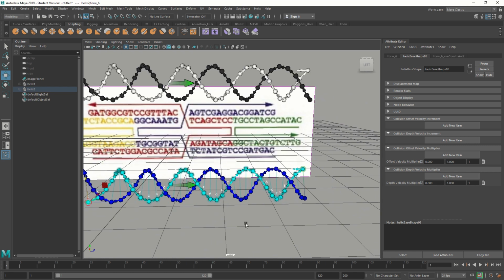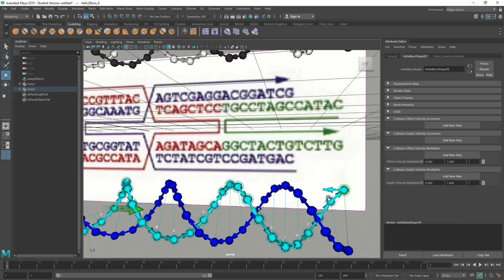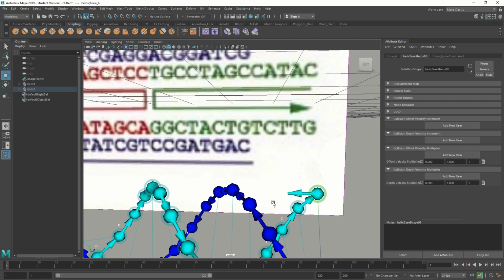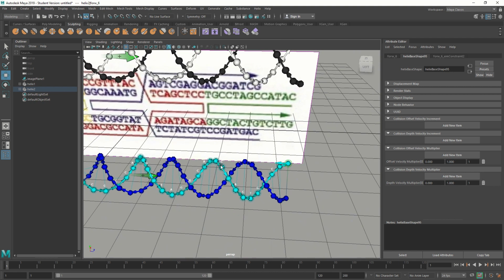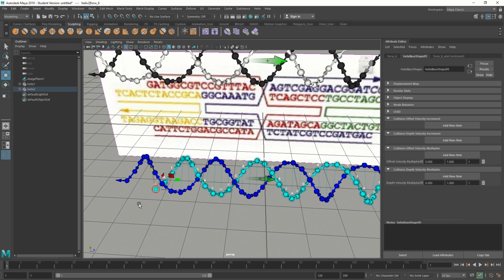So what we can check is whether sequence was assigned to the last nucleotide. And yes, there was, but something got a little bit wrong here. The last nucleotide should actually be a G. So I guess I messed up the sequence there somewhere. But it's just an example, so it doesn't matter.